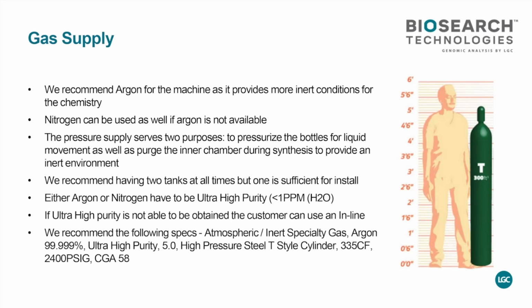So the first one I would recommend usually is argon, and we do recommend using it with the ultra pure quality, which is a very low water content. Something I forgot to mention to you: DNA chemistry is extremely water sensitive.